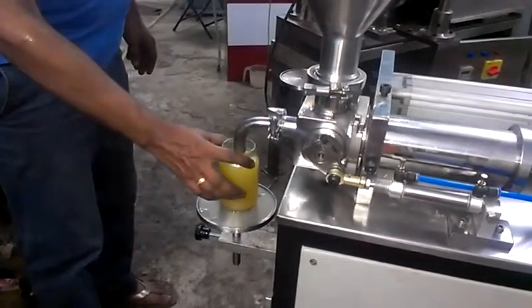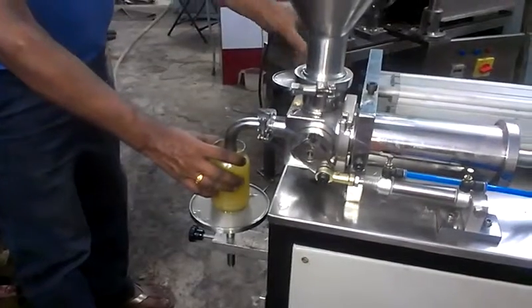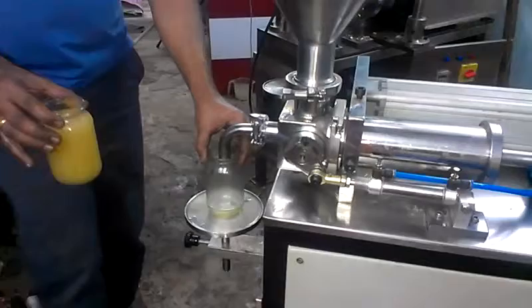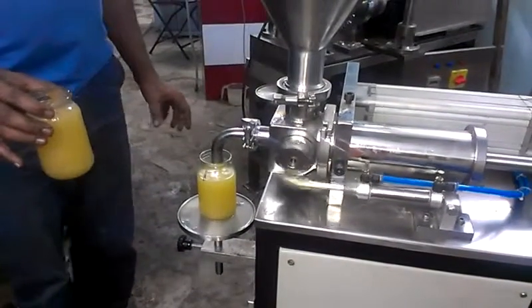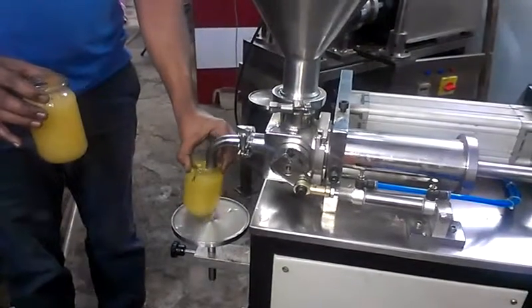We provide a pedal operating switch to operate this machine. Each filling will take approximately 3 to 4 seconds. The accuracy of filling is also very high in this machine.